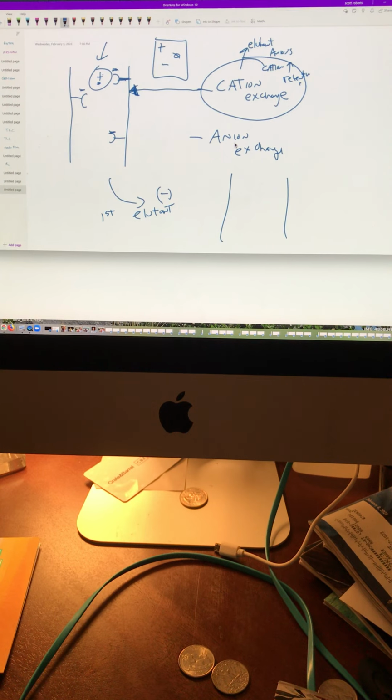At least you know your unknown is stuck in the funnel or in the tube. So in cation exchange, what are you trying to isolate? The anion or cation? It could be either. Because maybe the anions come off and you catch them. Does that make sense? So for sure, if you don't use salt, that stuff's stuck up in your tube. Got it? That makes sense, Ian?